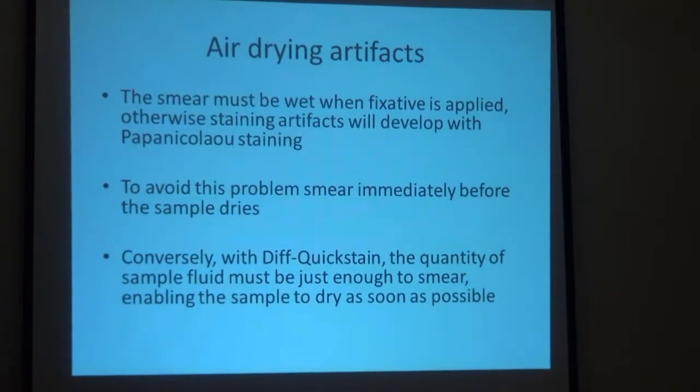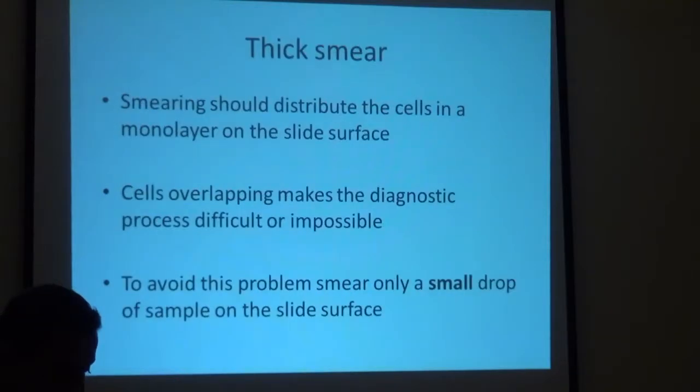Air drying artifacts also happen if you don't smear right away. Sometimes the technician may put the drop on the slide and wait, maybe do something else, like clean your needle for you, and then smear it. So I usually say I can wait, no problem, just do the smearing first. Make sure they do the smear while the sample is still wet, otherwise you're going to get drying artifact. This is the opposite of what you want to do for ROSE. In ROSE, you want it to dry. In the pathology, you want it to be still wet when you put it in the alcohol solution or other fixative that you use.